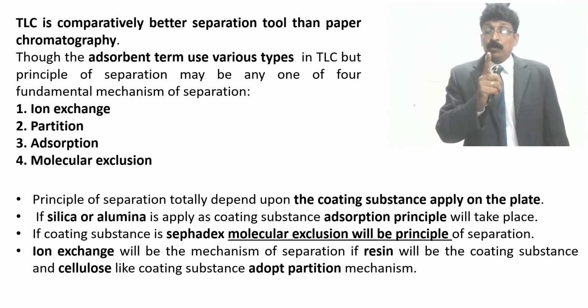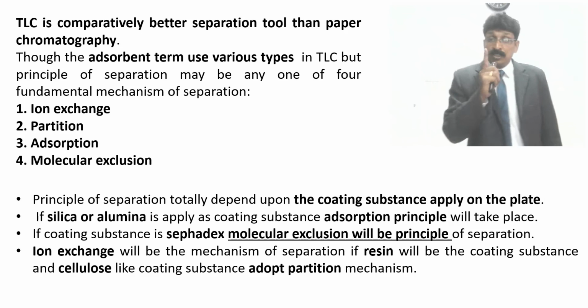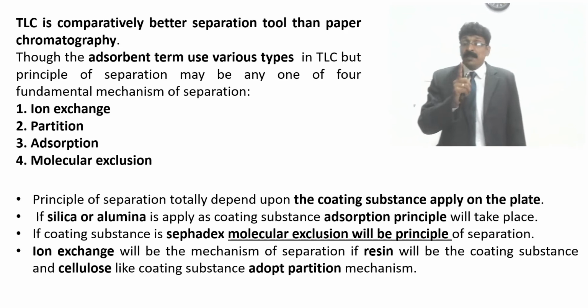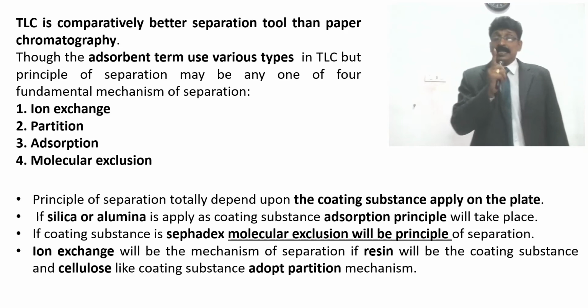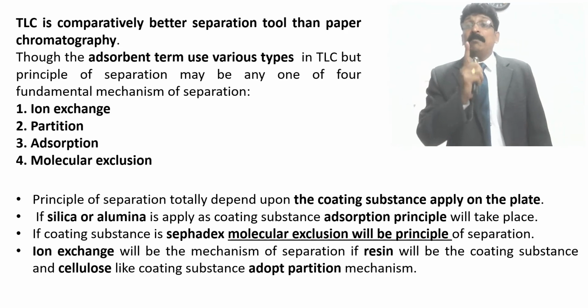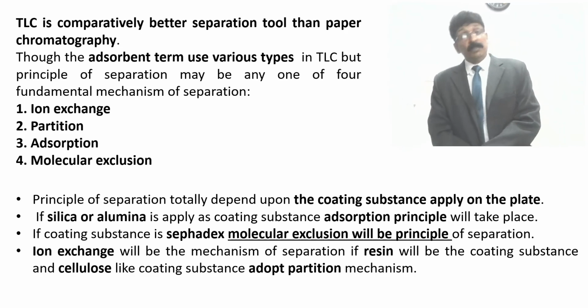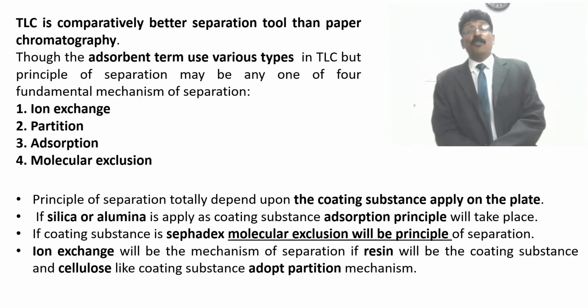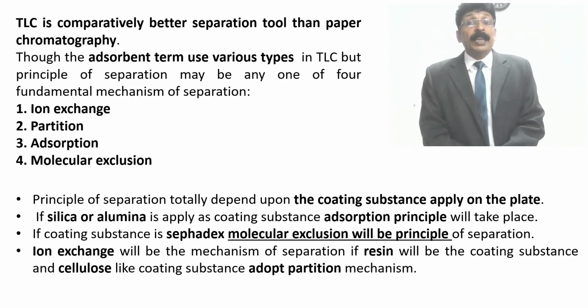That water molecule will act as a stationary phase, and the mobile phase which you are using is also liquid. So two immiscible liquids, the water is aqueous and you are using a non-aqueous solvent as a mobile phase, then automatically there will be immiscibility, and it will work as partition chromatography. So in thin layer chromatography also, it is possible to go for partition chromatography if you are coating the glass plate using cellulose.